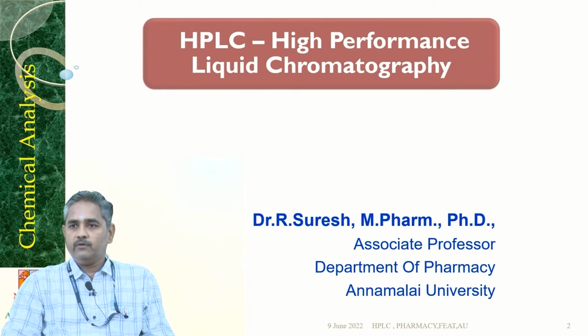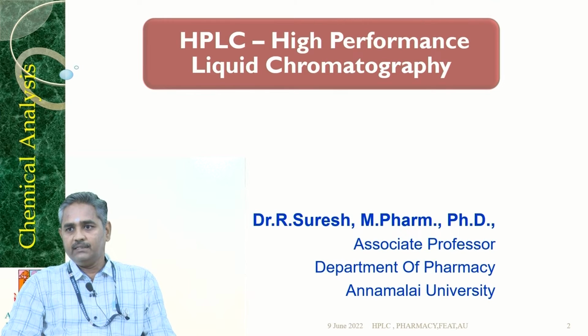Today I am going to give a lecture about HPLC, High Performance Liquid Chromatography. High Performance Liquid Chromatography is an instrumental technique which is used to separate and analyze a given chemical compound. It is applied in all the fields of sciences like pharmacy, medicine, chemical engineering and agriculture. High performance liquid chromatography is otherwise called high pressure liquid chromatography.